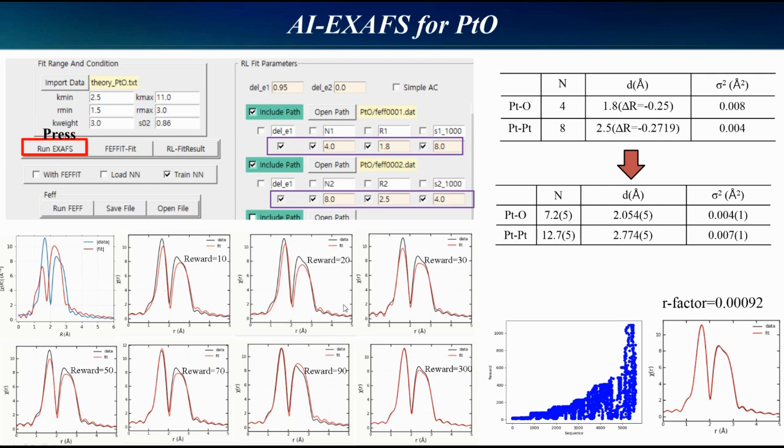Look at this. The table, and here are the tables and the figures below, reveal the fitting result from JAI-EXAFS. These figures show how well the deep RL finds the best fit.